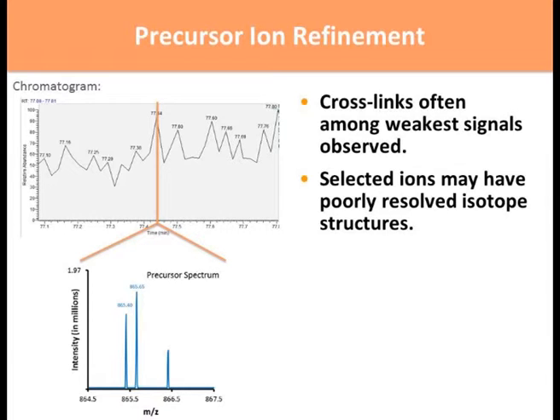A common problem with cross-linked peptides in a sample, even if you have a purified sample, is that the abundance of the cross-linked peptides is usually much lower than the abundance of all the non-linked peptides in the sample. And that's because cross-linking isn't a 100% process or 100% reaction when cross-linker is applied to a sample. So your cross-linking efficiency might be very low for a given site due to its availability or any biases of the cross-linker to an easier to identify and react with site.